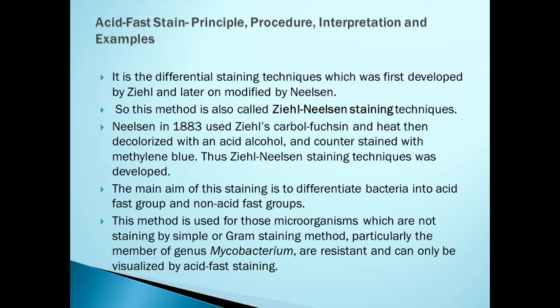So it is a differential staining and it was first developed by Ziehl and then modified by Neelsen. So this is also called the Ziehl-Neelsen technique. Or it is also called the Ziehl-Neelsen carbol fuchsin staining, that is ZNCF. Neelsen in 1883 used Ziehl's carbol fuchsin and heat and then decolorized with acid alcohol and then counterstained with methylene blue. And thus the Ziehl-Neelsen staining technique was developed.